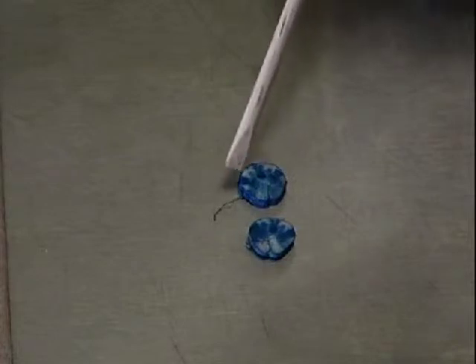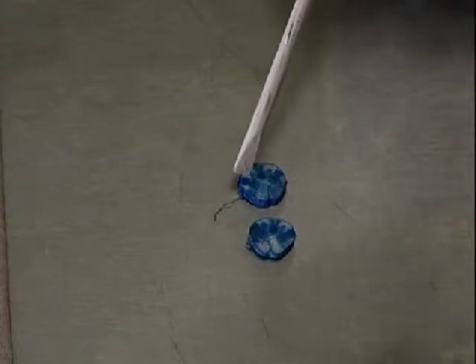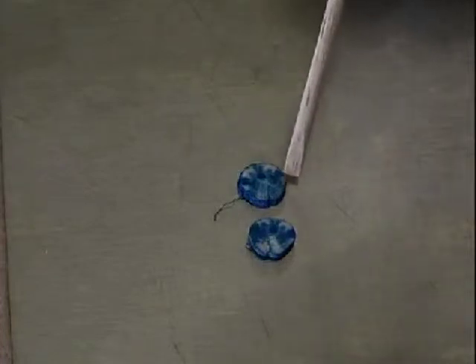And you can see a big stained nucleus here, which would be spinal nucleus of 5. On the other side, you can see the nucleus and a little white area outside of it called the spinal tract 5. Now we're at the famous level 3.